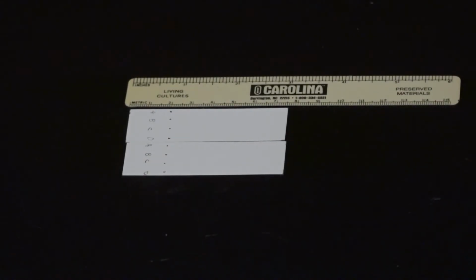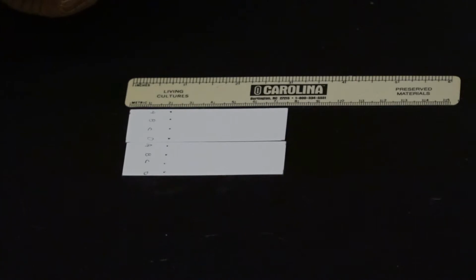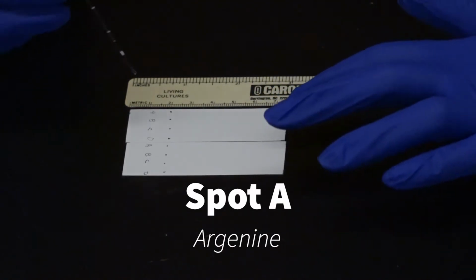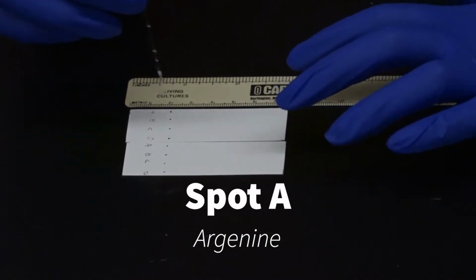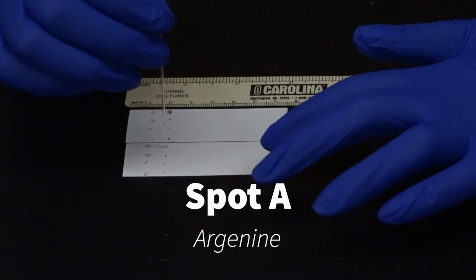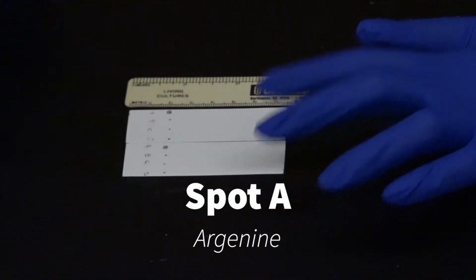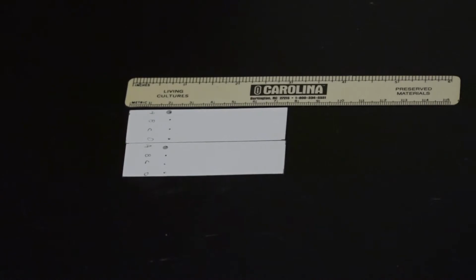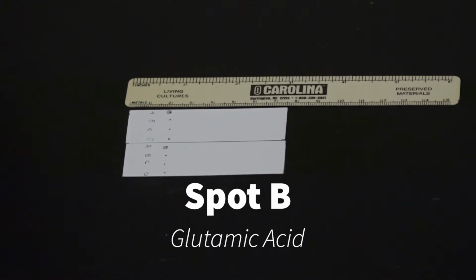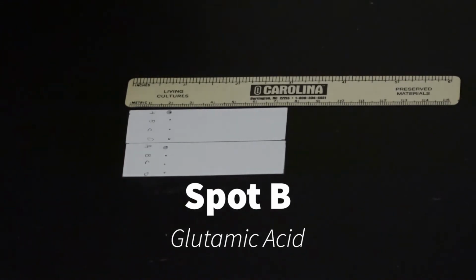Okay, so now I am dipping my capillary tube into my arginine beaker. It picks up a bit of solution due to that wonderful capillary action we talked about. And I'm dropping arginine on spot A on both sheets. Here comes amino acid 2, B as in boy, which is glutamic acid. Just want to double check.